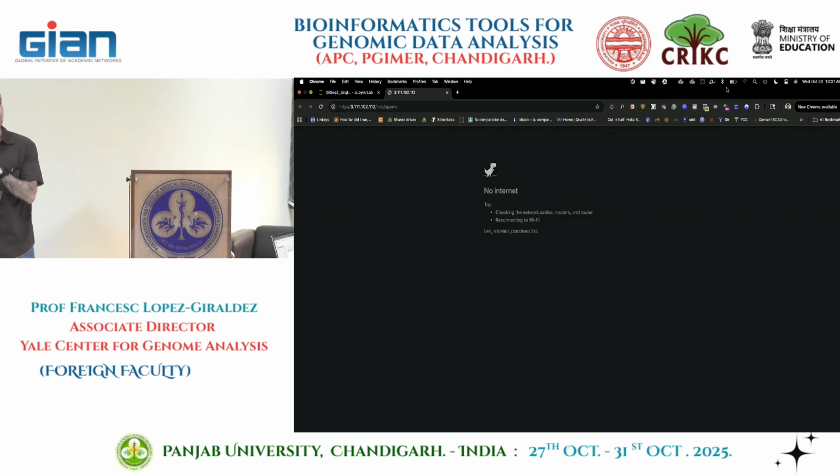Every step we're taking, you don't have to do in your analysis. We're just exploring the data. You're barely ever going to run coefficients. Generally, we're going through all these steps just to explore and understand what is happening a little bit in the background. But the coefficients, I barely ever use them. The coefficients are on your final table, your fold changes anyway. You want to know the p-values, the fold changes, you don't have to do all this.